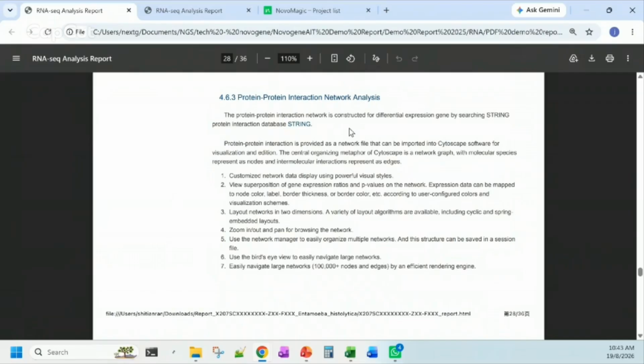You can see what are the genes or their coding proteins interacting with each other or having certain correlation with one another. So this one can help to quickly identify whether a certain gene is actually the driver for all the expression. So if, let's say, we have one gene and it is related to many other genes, and all of them are also differentially expressed, then we might be interested in looking into this one, because it could be the one driving all the changes inside the samples.